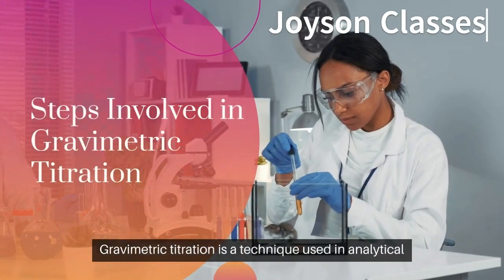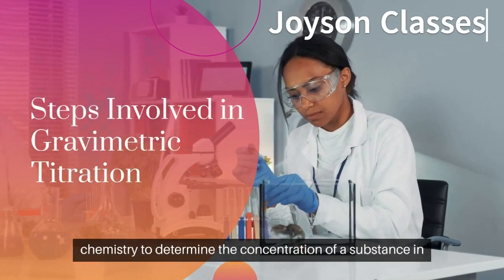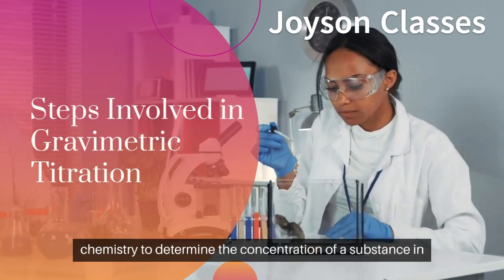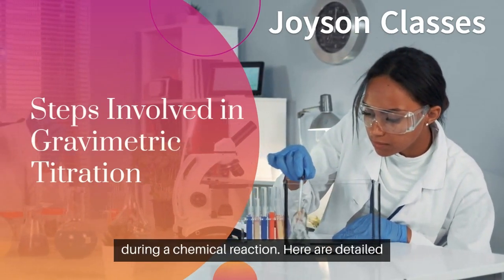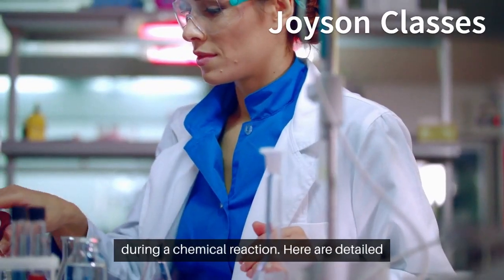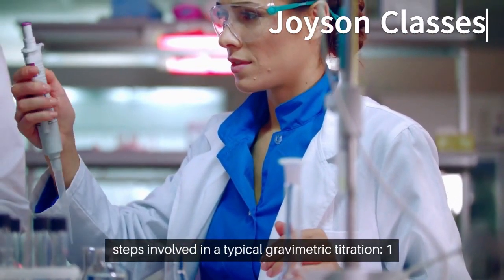Gravimetric titration is a technique used in analytical chemistry to determine the concentration of a substance in a sample by measuring the mass of a precipitate formed during a chemical reaction. Here are detailed steps involved in a typical gravimetric titration.